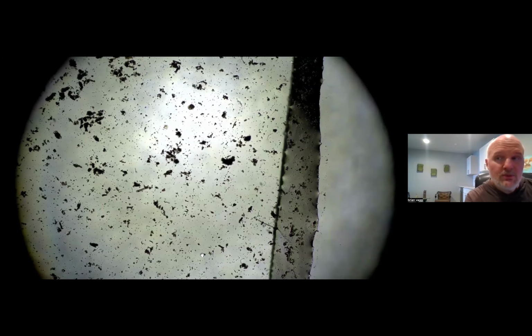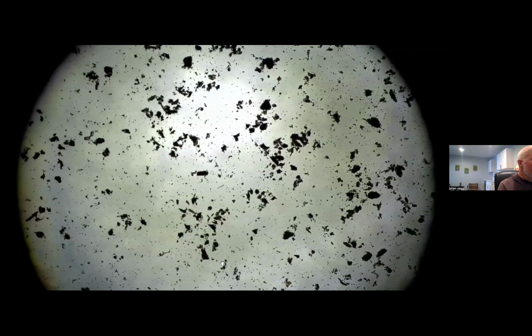And also another thing that's really helpful when we're talking about microscopes is to give everybody the magnification we're looking at right now. So right now I am using my 4x objective and I have 10x eyepieces. And so really what that means is I have a total magnification of 40. And you're going to see as I move through the objectives, we'll get a higher level of magnification. So I'll show you a difference between a 40 total magnification versus a 400 total magnification. But I use the 40 total magnification to scan to see if I can find anything interesting.